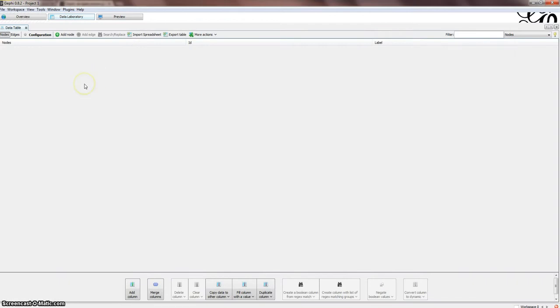So we come to the data laboratory, and what we're going to do is first import the nodes. This is important, as you'll see in a moment, because it brings in the numbers that are assigned to the reactants. Remember, the list of nodes is the same as the vertex in Node Excel. And then the edges still are the reactions, and we'll import this table second, and we see a source and a target, and it'll be the numbers of the reactants that end up in these columns.